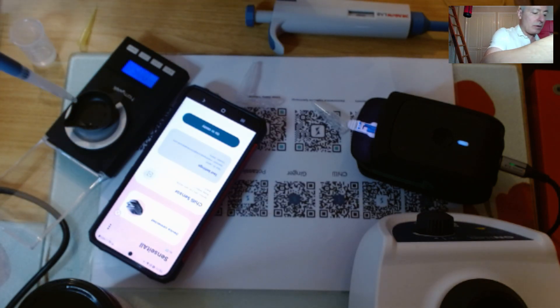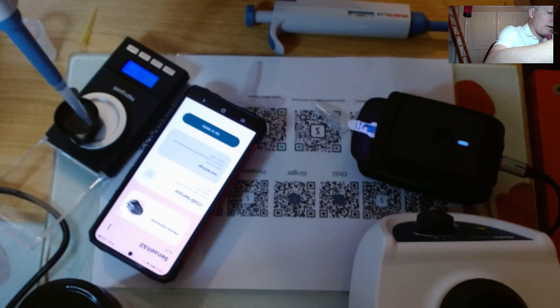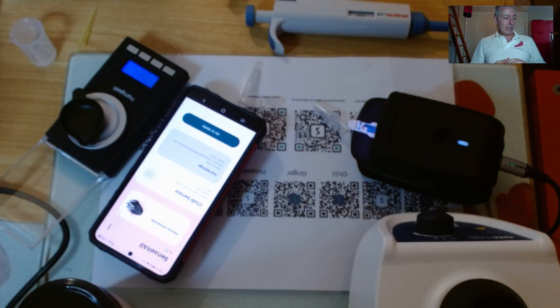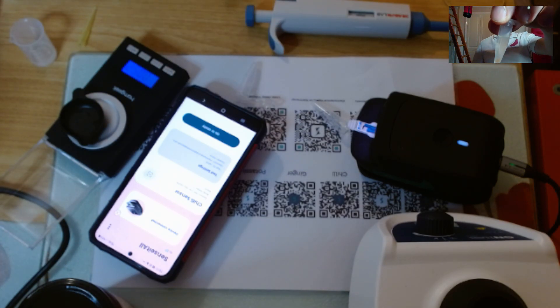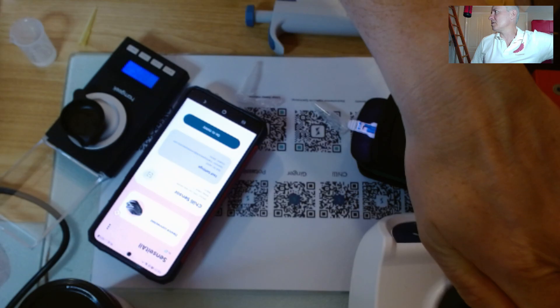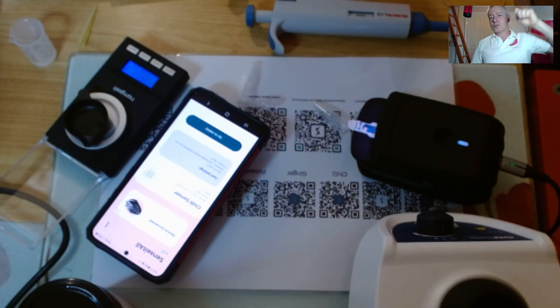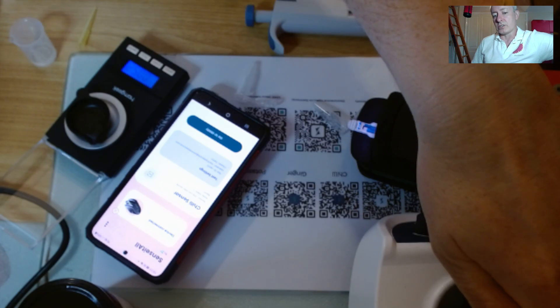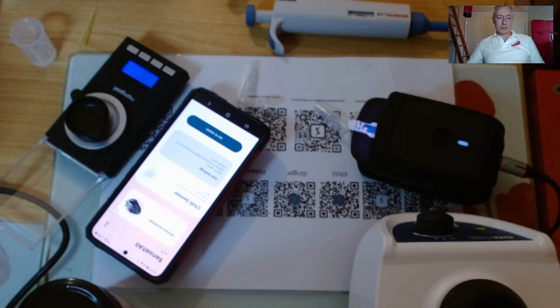So I'm just getting all of that solution now. I've prepared the sample. I'm going to give it a quick vortex – the vortexer just shakes like crazy. I'm vibrating it manually because without a vortexer I won't be anywhere near as efficient. It's probably worth saying a vortexer is only about £50, so it's not super expensive. Now my sample looks slightly cloudy with some chunks in it – there's about 0.1 grams of the jelly and about 0.9 milliliters of the buffer.